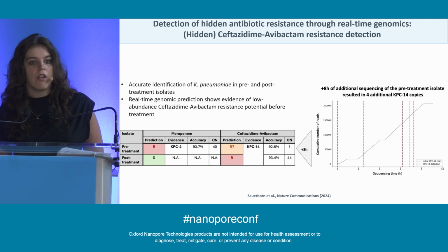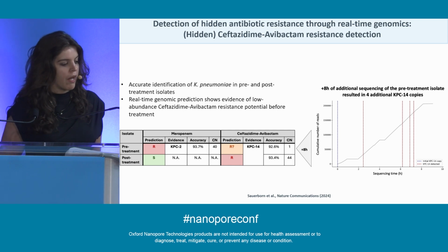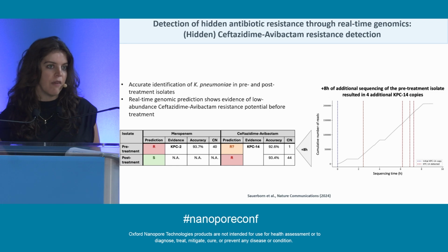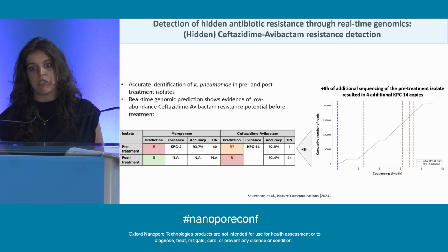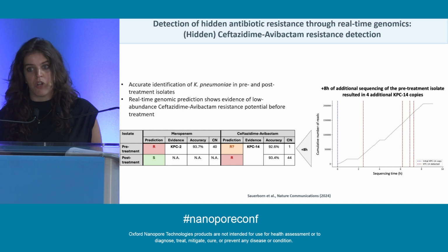Now, we argued that potentially we were able, with real-time genomics, to show evidence of low abundance pre-existing ceftazidime-avibactam resistance potential prior to ceftazidime-avibactam exposure, which might have guided a different antibiotic regimen to start with.